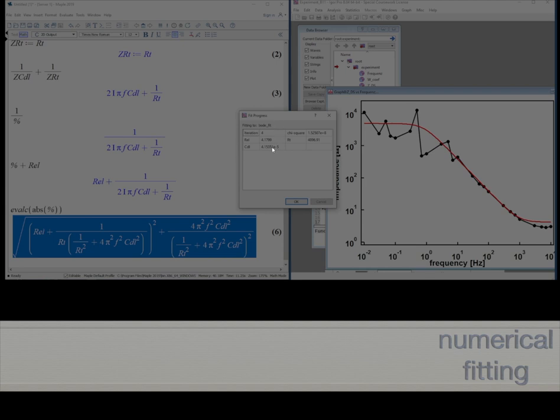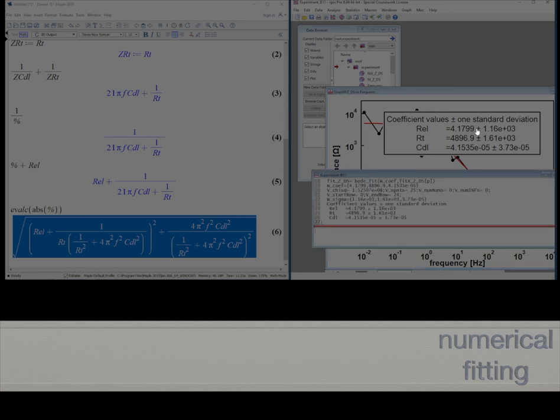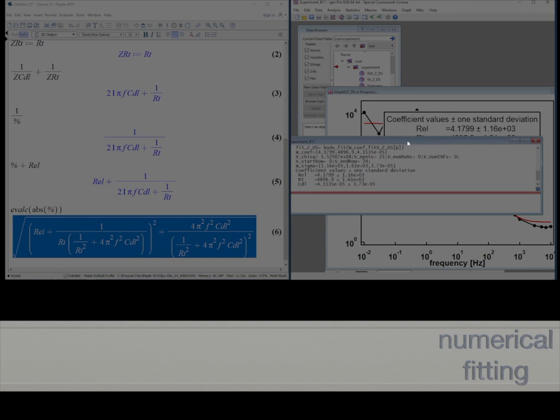Now, if you want to know how good your fit is, you can see it here. The double layer capacitance of 41 microfarad, you have an error of 37. The transfer resistivity is pretty good, and the electrolyte resistance 4 Ohms. It's okay, not so good, I guess.